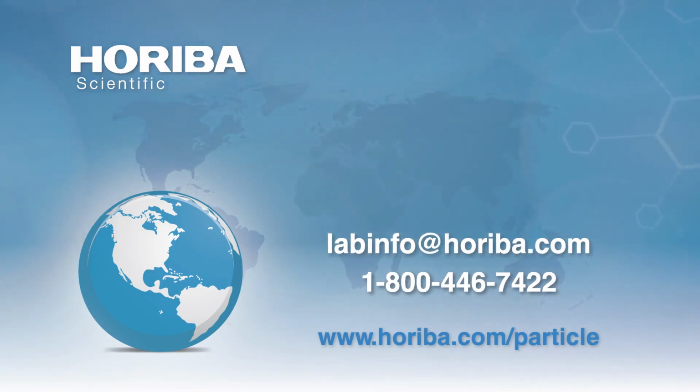Because what you're going to start out with in both cases is a measurement before you even put the sample in there. So you're going to have a good idea exactly how much light is coming through. You put your sample in there, and whatever value that comes to, let's say 80% T, when you're done running the sample and you clean it out, if you put that same sample back in again, it should come right back up to 80% T.